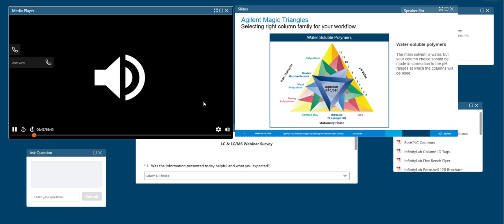If we look at the outside triangle, let's look at neutral macromolecules. Inside the bigger triangle, look at the blue inner triangle. These sample types would be run at a neutral pH 7. Looking then at the third point of the triangle, we find that the Suprema or the PL Aquagel OH stationary phases are those best suited for these types of samples.